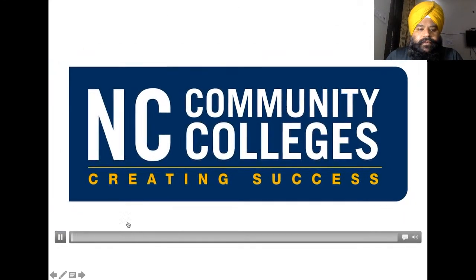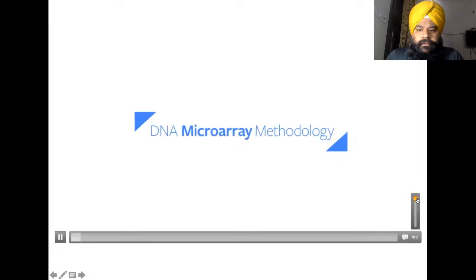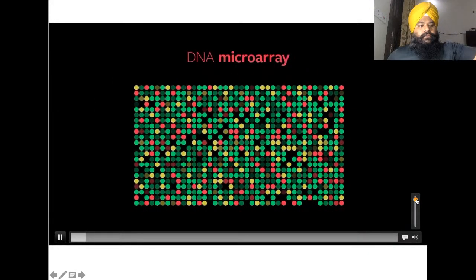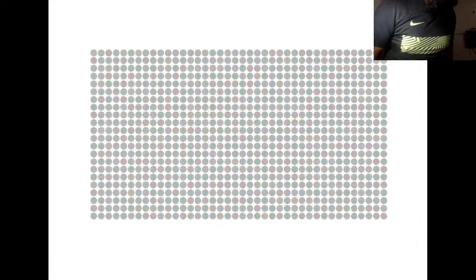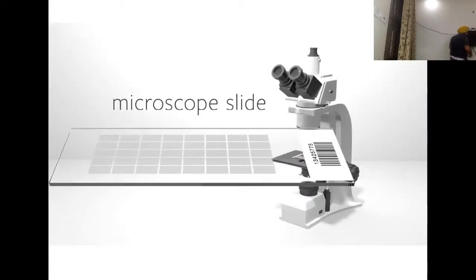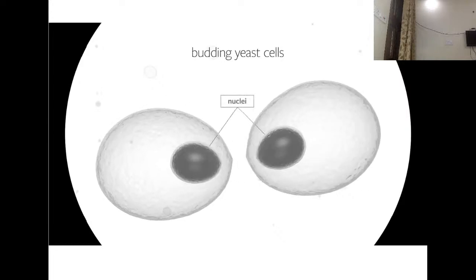So let's check how this is done. This animation will demonstrate how DNA microarray experiments are performed. DNA microarrays, sometimes called DNA chips, reveal the expression of thousands of genes on a solid surface, such as a microscope slide. In this example, we'll use yeast as a model system to illustrate one use of microarrays.